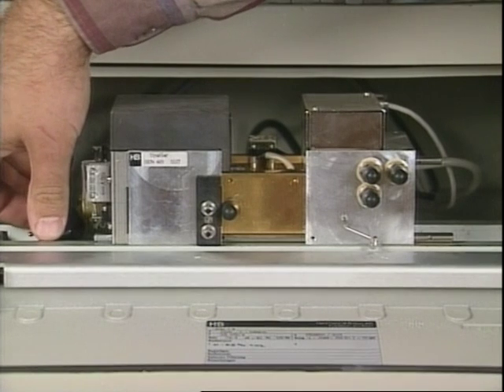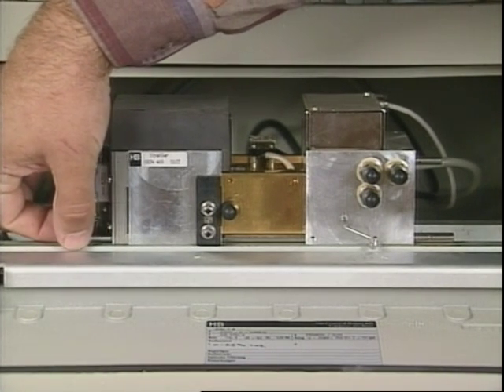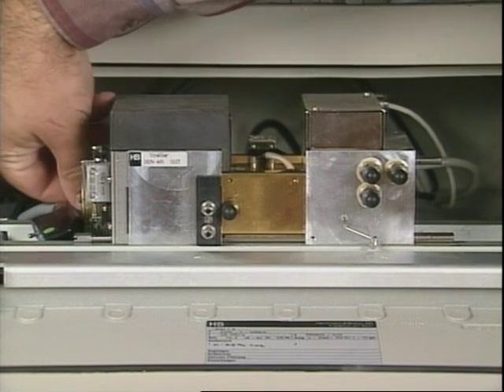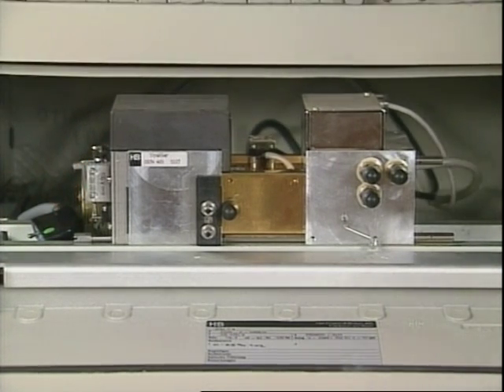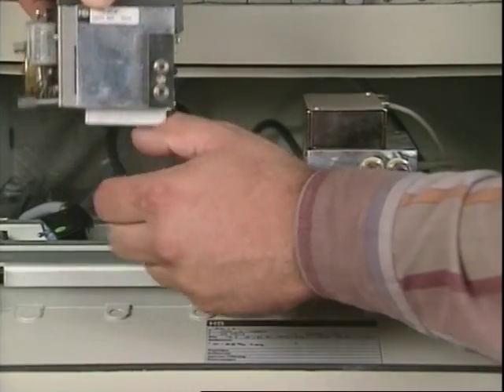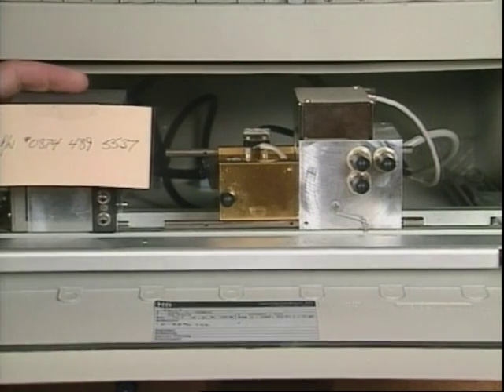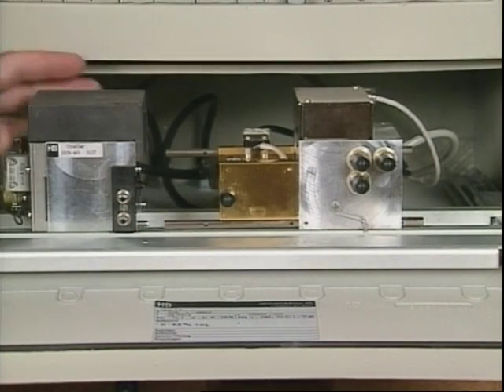First, de-energize the analyzer, then disconnect the signal connections. For this analyzer, remove the chopper motor module. Remove any screws or brackets securing the failed motor and lift the motor out of the analyzer. Install a replacement module according to the manufacturer's instructions.